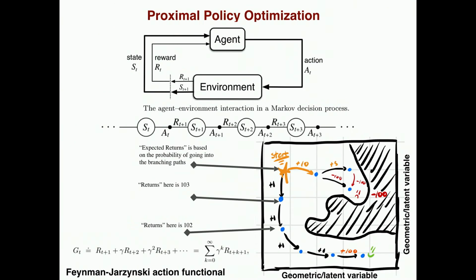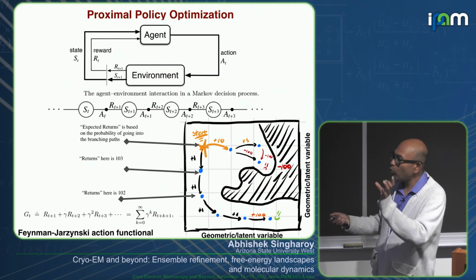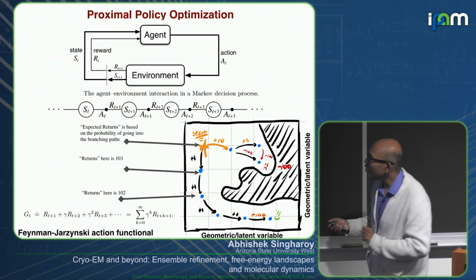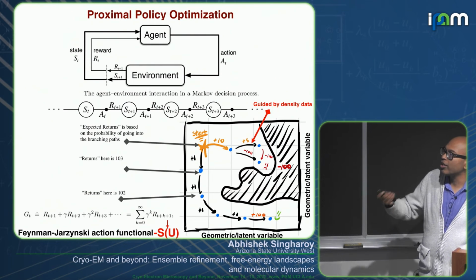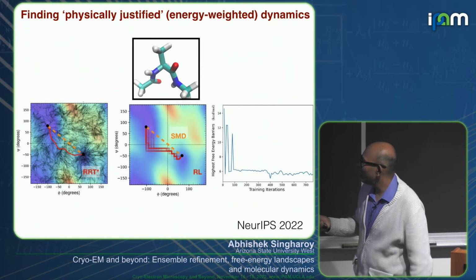Essentially you start from point A, the agent starts moving, you give it a grid, the agent moves on that grid, and it would get stuck somewhere, because here it will find a barrier. So the energy part of the Feynman path integral would complain. Maybe it will have 2 equal paths, but it will take the path where the force part is important. And of course, the reward is computed based on cryo-electron densities. So with that, we can start doing very cool things.